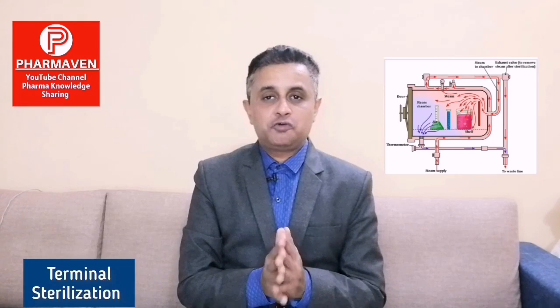Terminal sterilized product also undergoes rapid cooling. In that case, when we are rapidly cooling, the chamber pressure will drop faster than the pressure inside the container. If the vial cannot sustain it, then we have to provide air over pressure during cooling. In case of a flexible bag, it cannot sustain that rapid decrease in pressure inside the chamber, so it can burst. So in the cooling phase also air over pressure is required. In order to maintain the container's integrity, it is required to have air over pressure during steam sterilization as well as during the cooling phase.